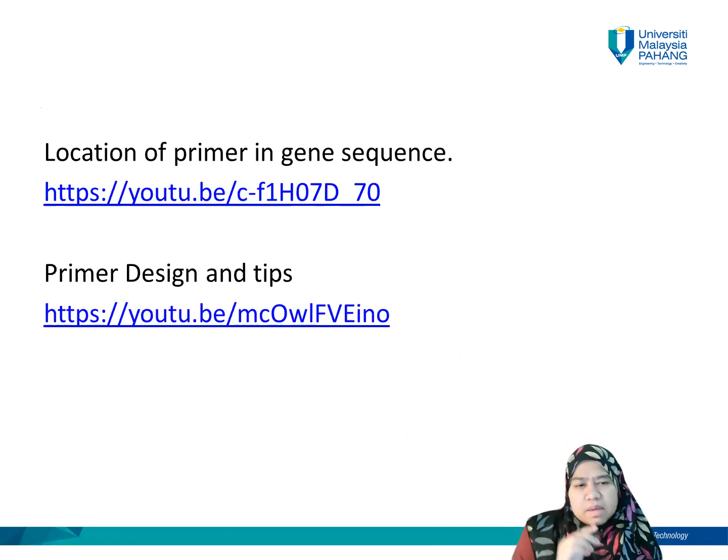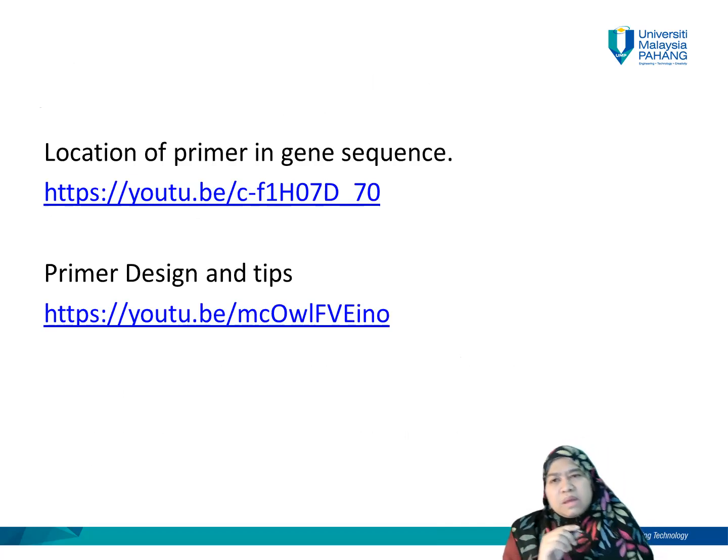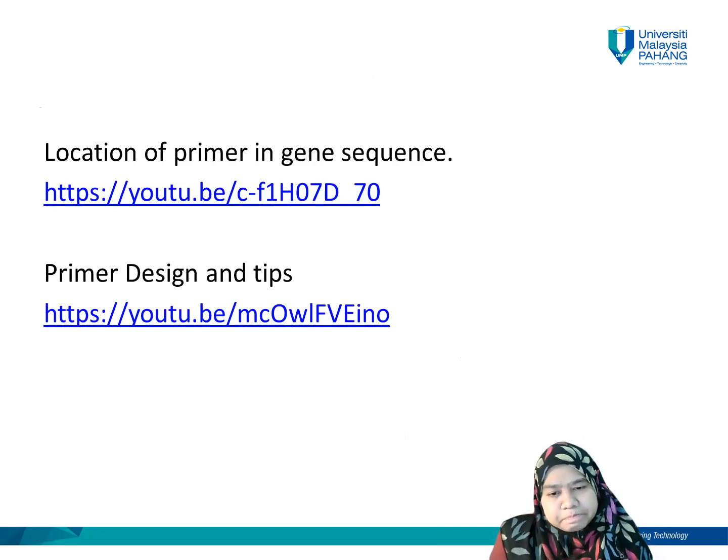Here are some YouTube channels that you can go into, on how to find the location of the primer in the gene sequence, as well as primer design and tips.